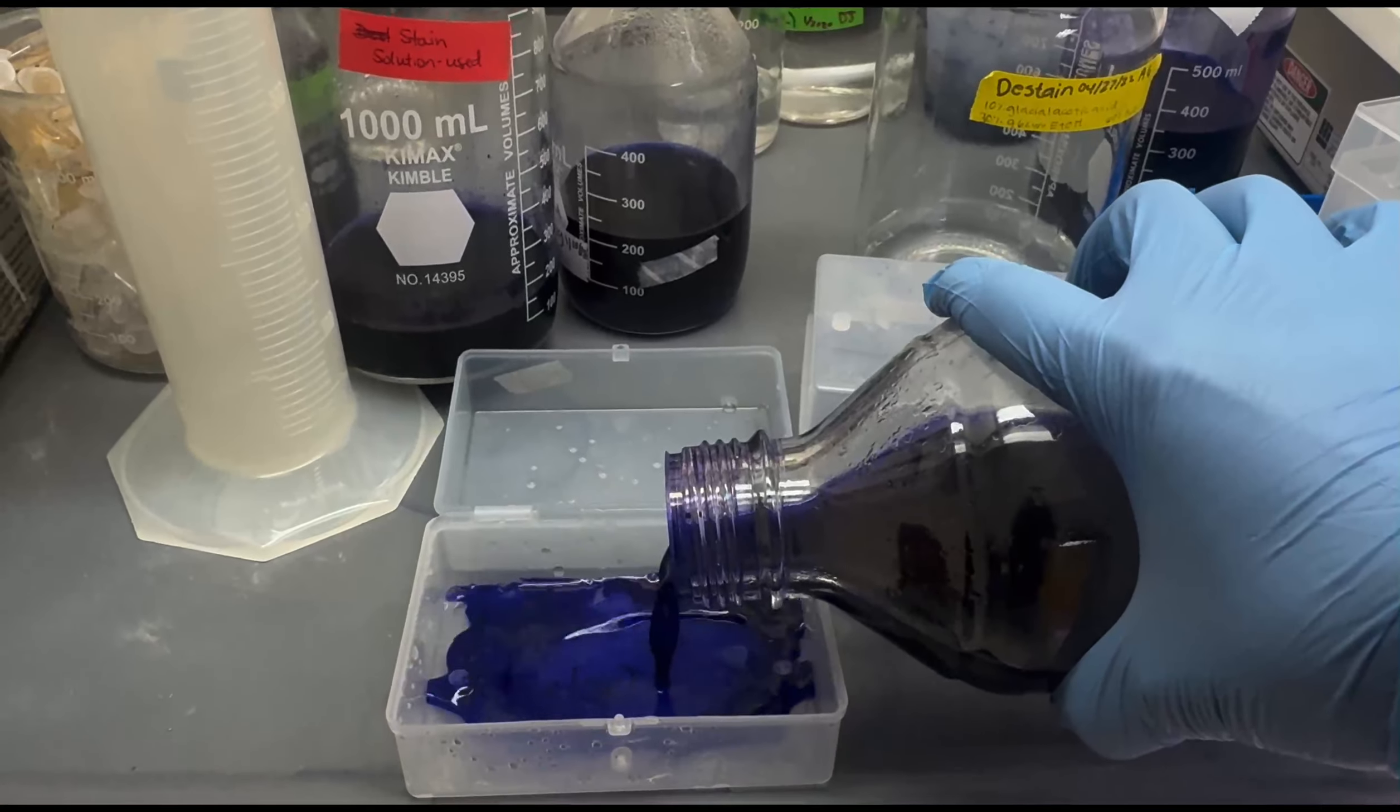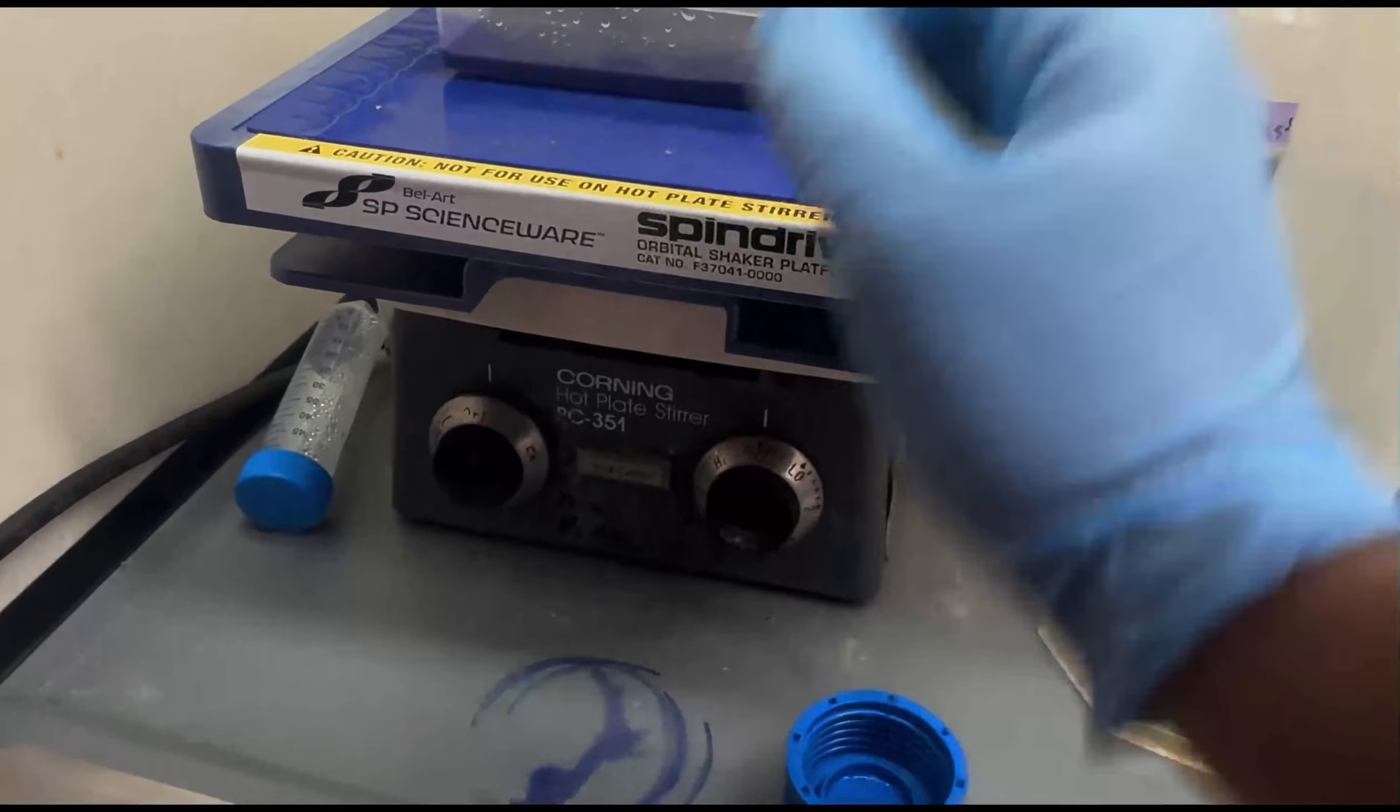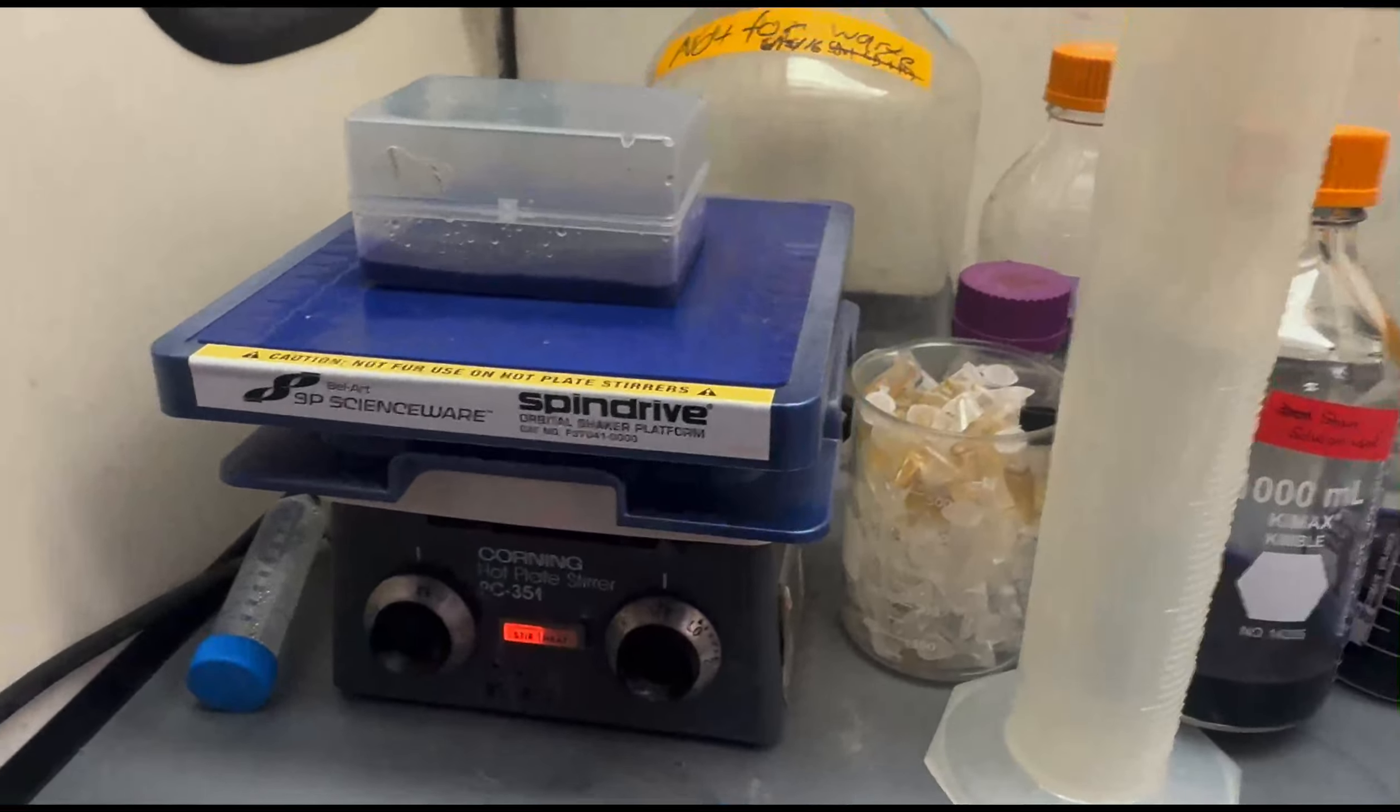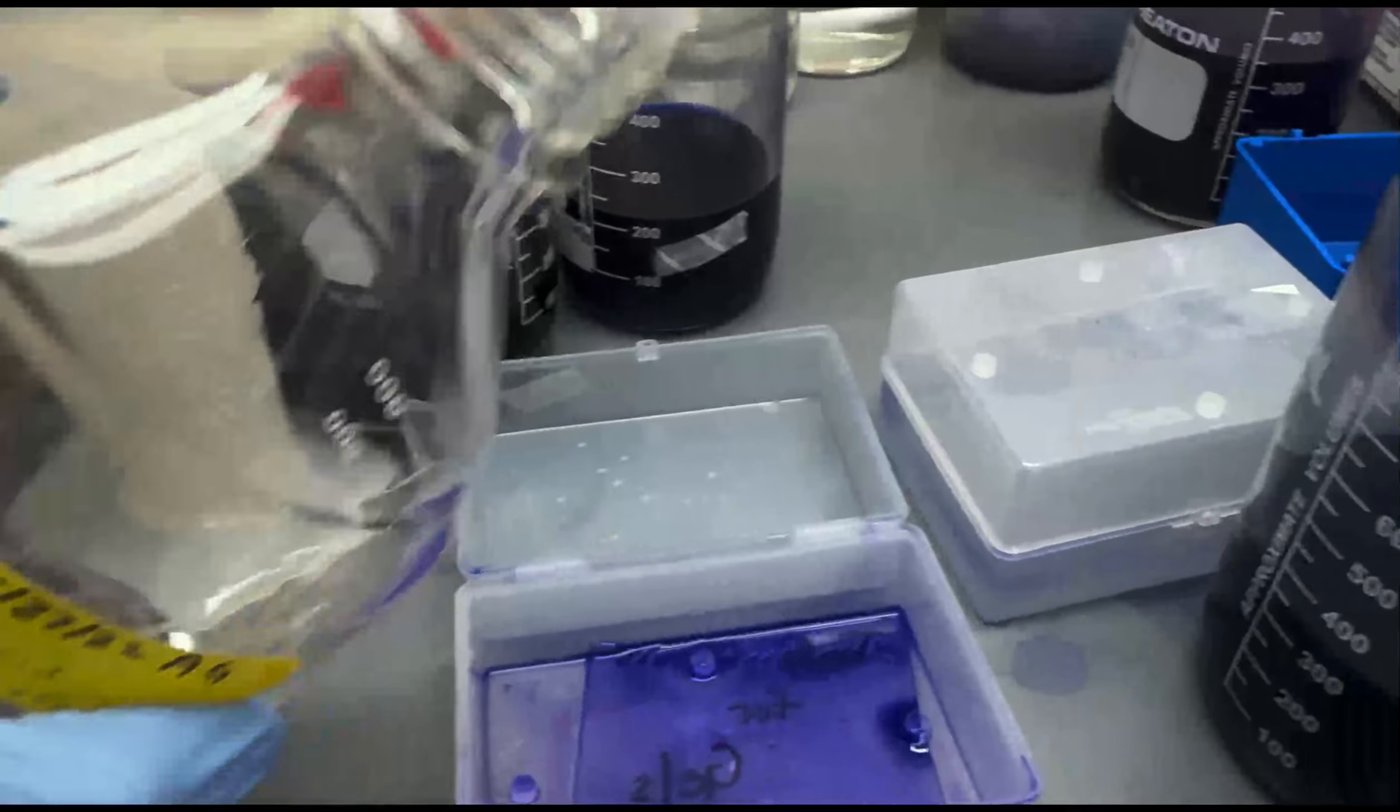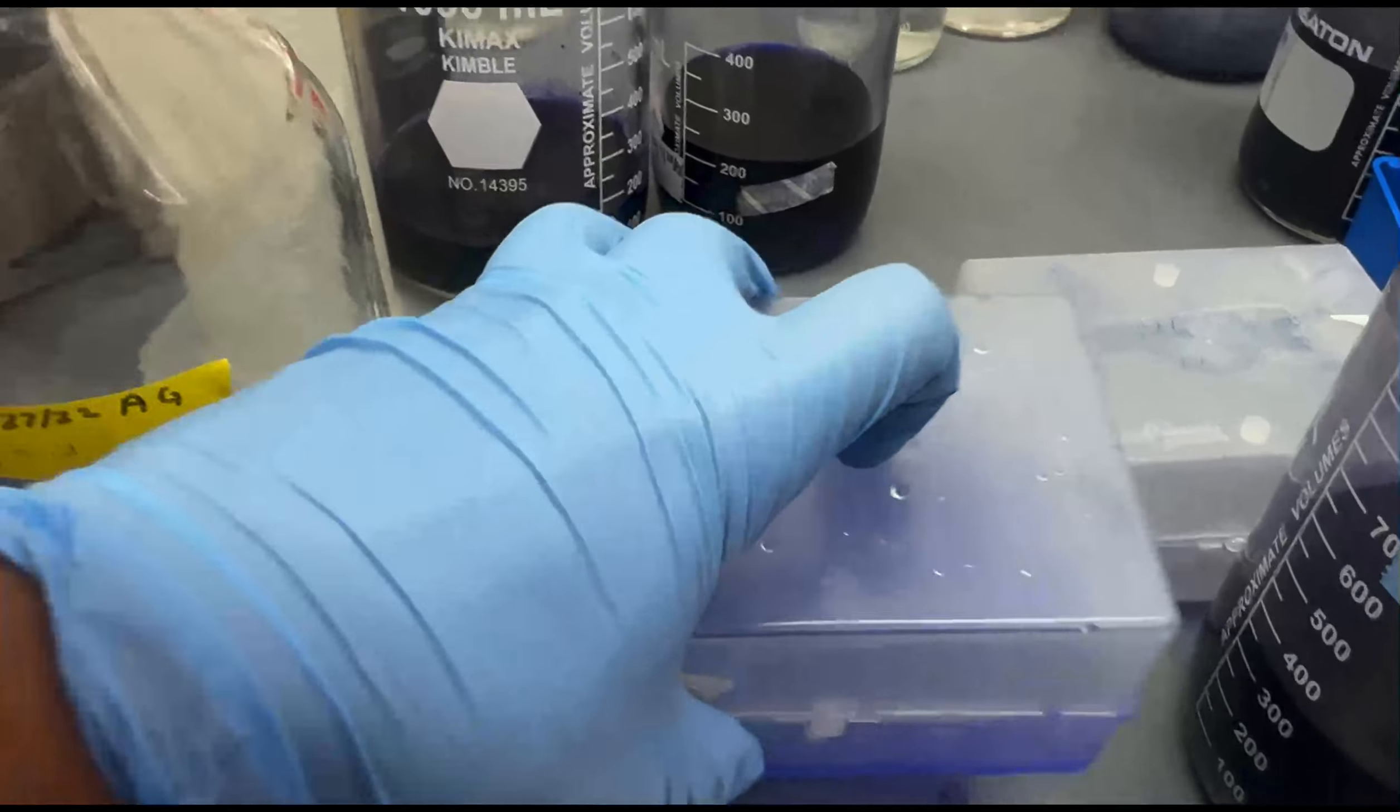After the DI rinse, the gel is placed in a Coomassie Blue solution for staining for about one hour with light shaking. Once complete, the gel is then washed with de-staining solution for at least four hours before the gel is ready to be visualized.